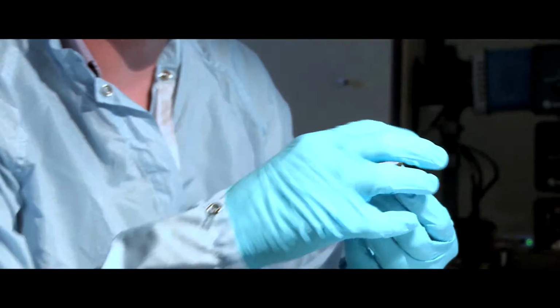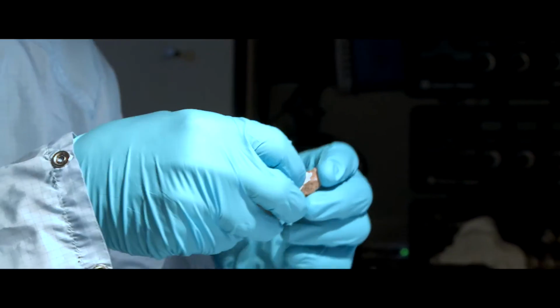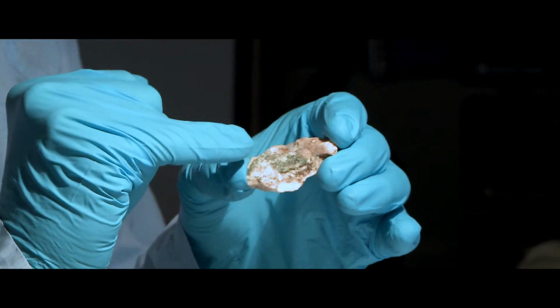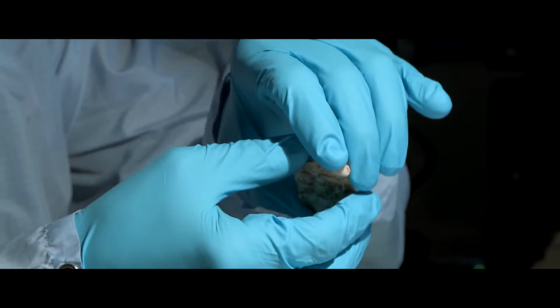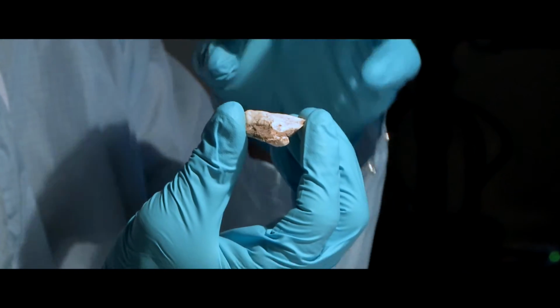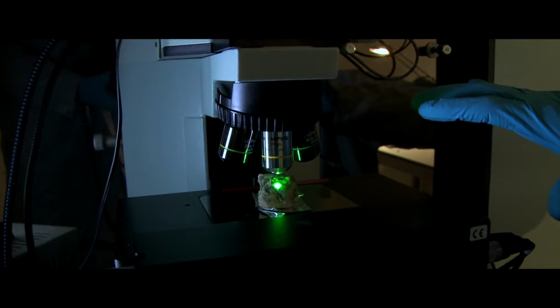This is one of the pieces of quartz that you saw me sampling and picking up. And this is where, if you turn it over and look underneath, you see the green colour, the colonization of the cyanobacteria on the underside of the quartz, where they've been protected from the dry and the ultraviolet radiation in the desert. So we've put our quartz sample on the sample stage of this microscopic Raman system here.